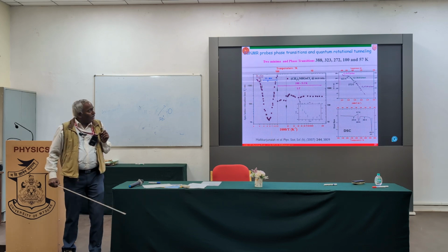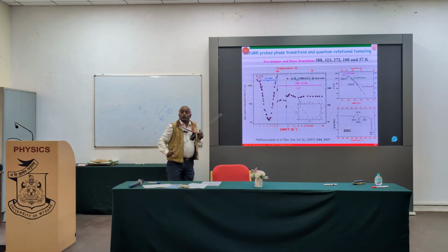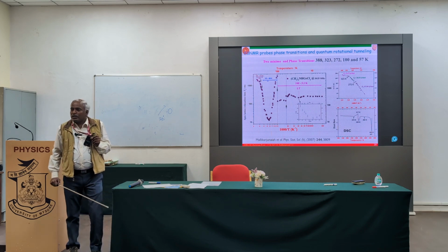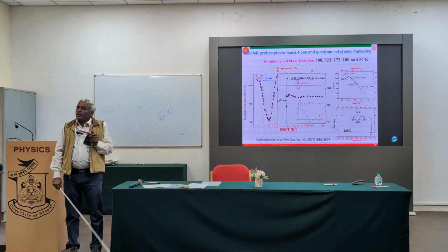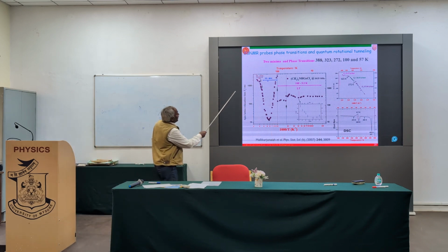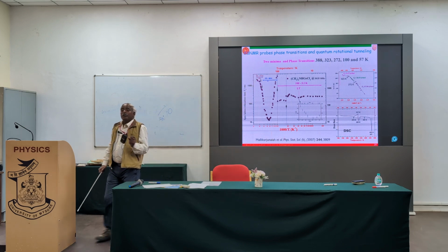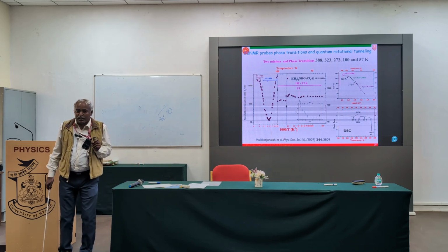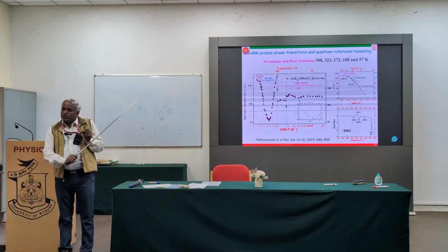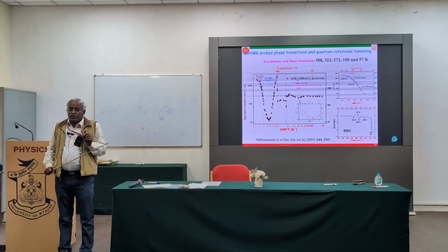We used to send it so that the fluctuation in the current passing through the coil is constant and the magnetic field is constant. And each data point was derived out of another 25 data points that we had taken, what we call inversion recovery. The minimum number of points required to get one data point is 20 plus. It takes about 30 minutes to generate one of these data points. Within the 30 minutes, a small fluctuation can happen at any time.